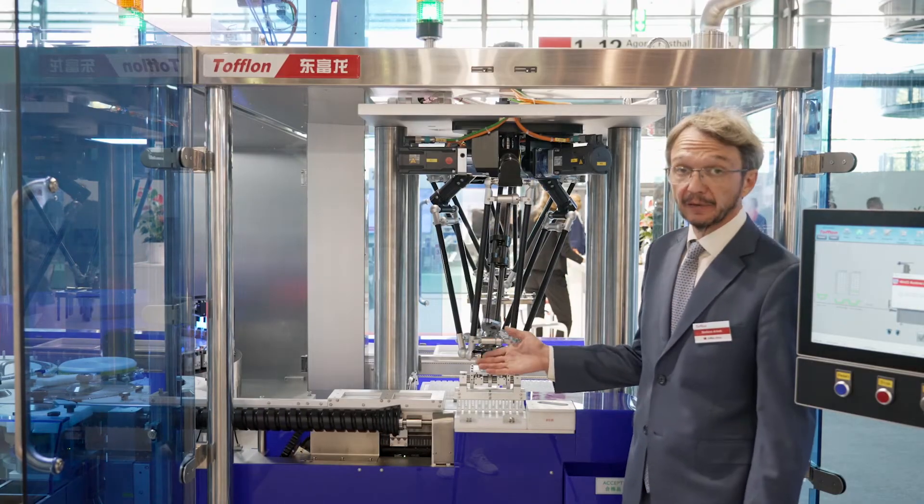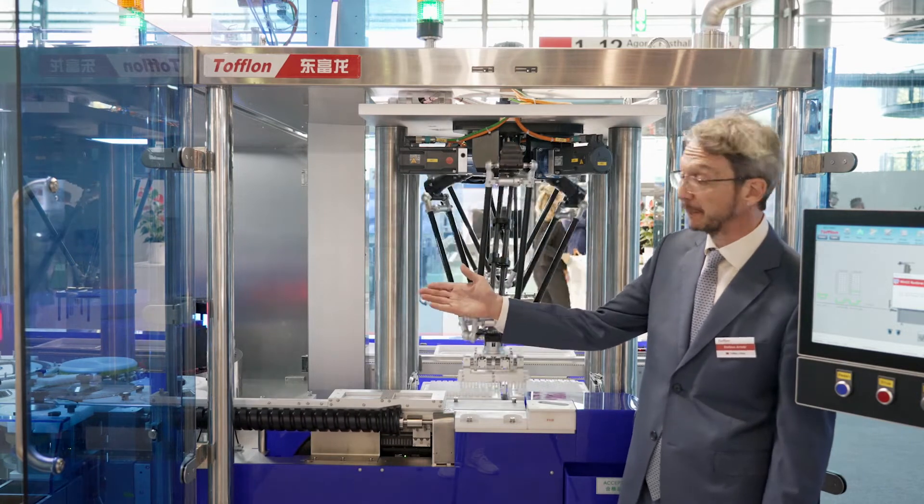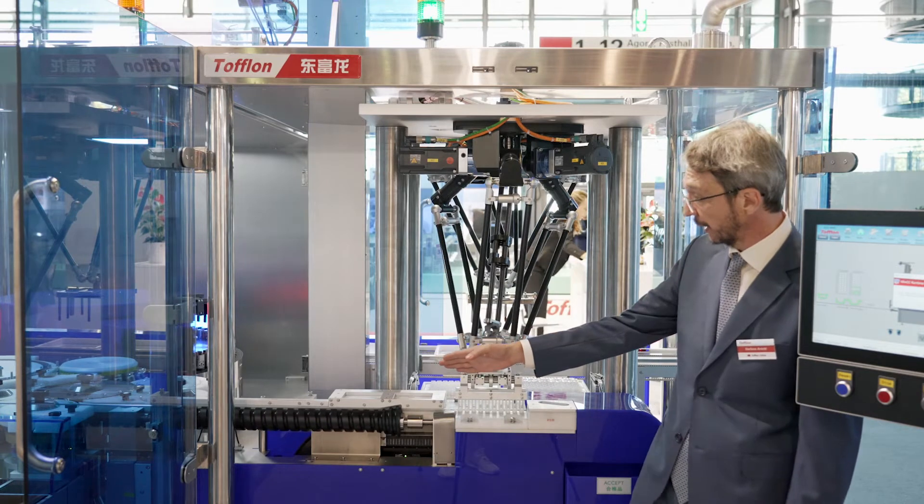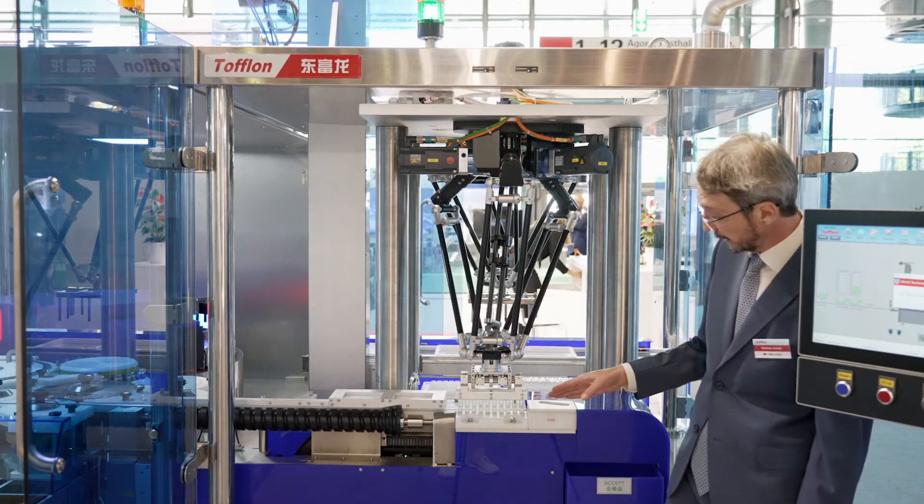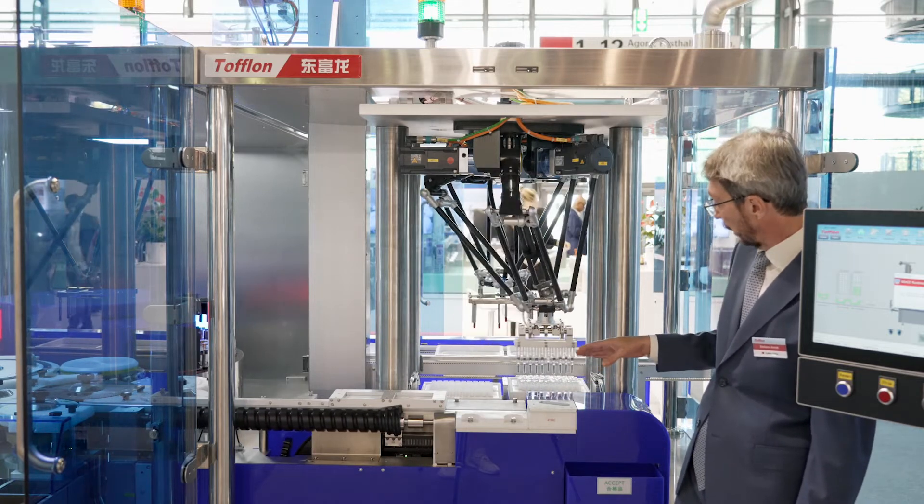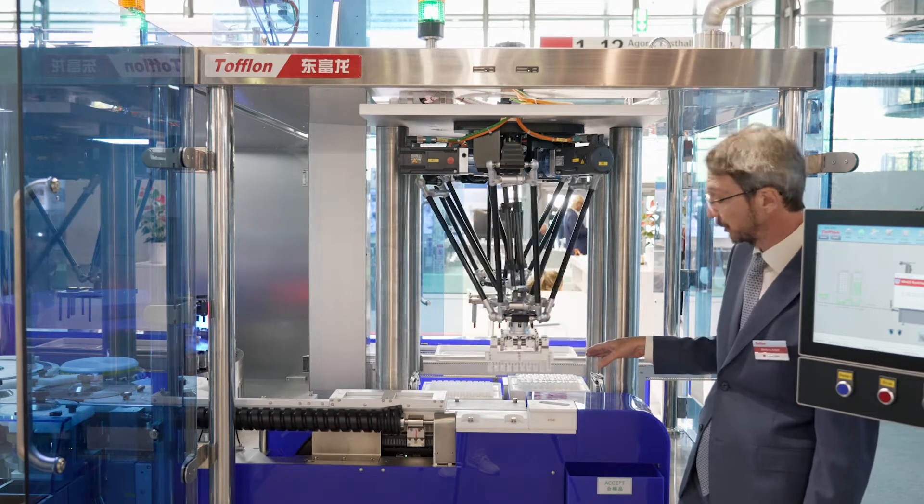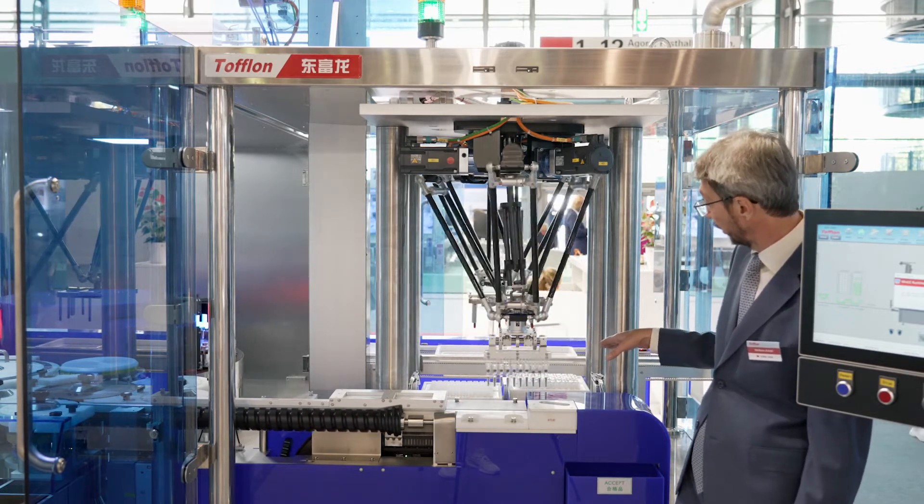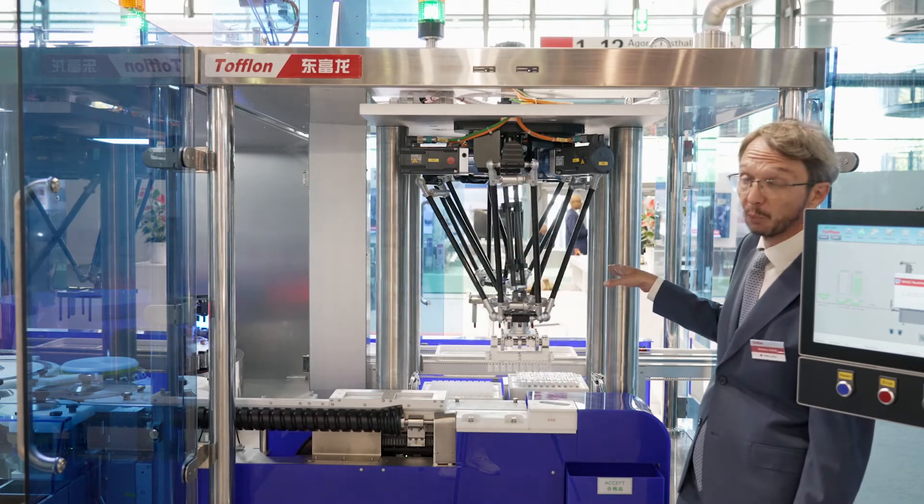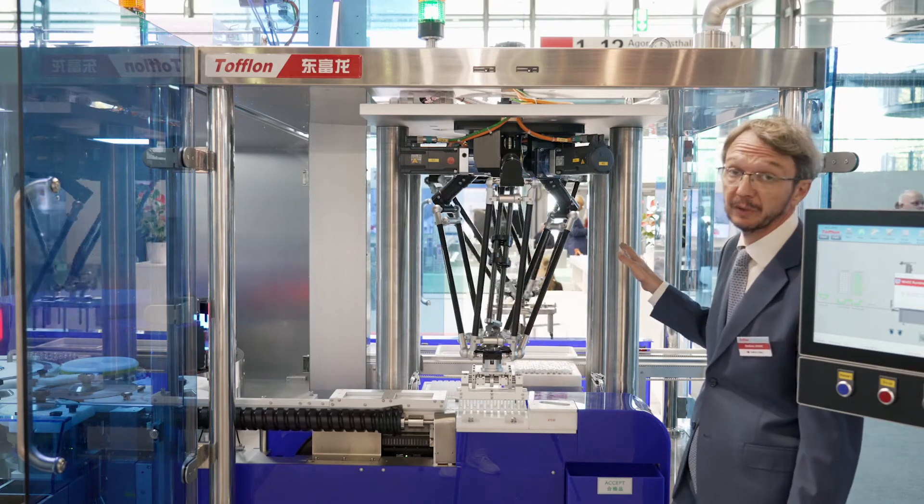This is the last part of the machine. After inspection, after removing the bad containers, the good syringes come out in the output area. They are picked up by the first robot, put in the nest again in a very gentle way, and then the fully loaded nest is put in the tray where it can proceed to the next manufacturing step.